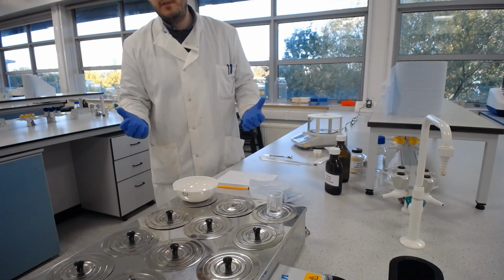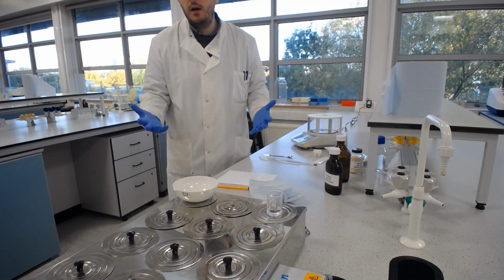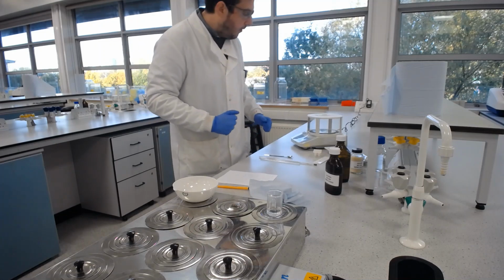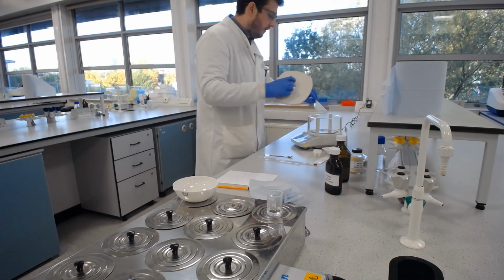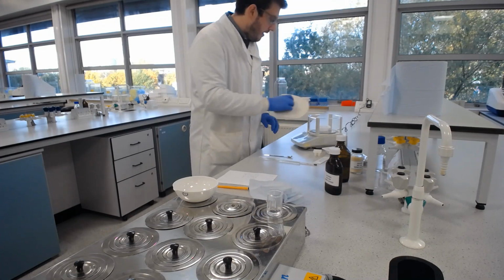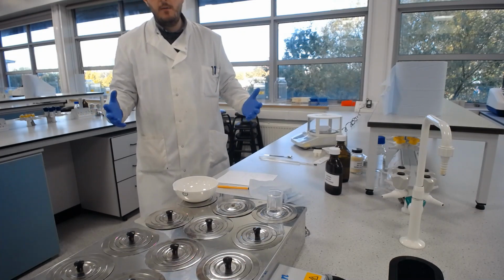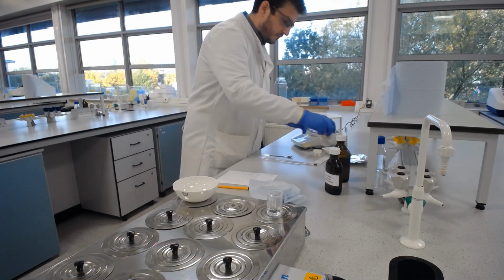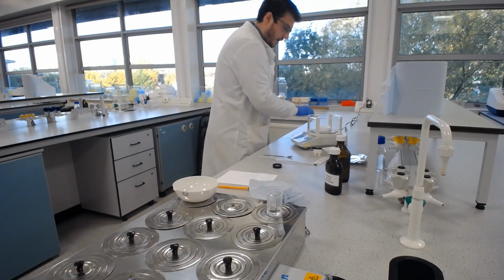We're warming them to 70 degrees to aid the mixing, and so the gelatin actually will disperse and suspend through the water. So on that note, I need to weigh out 1.6 grams of gelatin. So I'm going to do that into a weighing boat. And of course, I need to zero or tare, however you want to say it, my balance to do so. So on 0, I've got some gelatin here, and I've got a clean spatula.